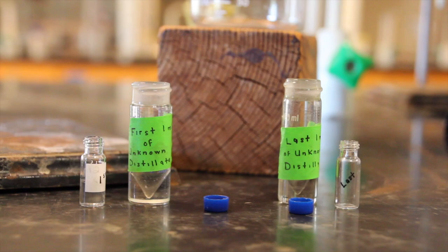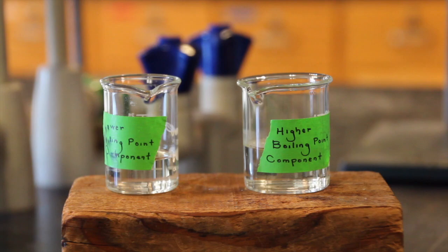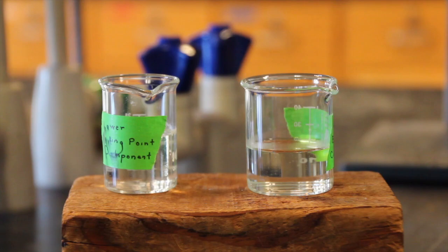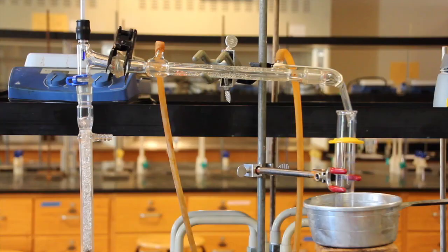For identification purposes, your group should obtain a GC for the first small sample and the last small sample obtained in the conical vials during a fractional distillation. In addition, you may also want to determine the water solubility of your fractions as further evidence in the unknown identification.